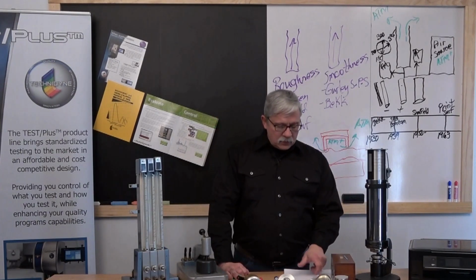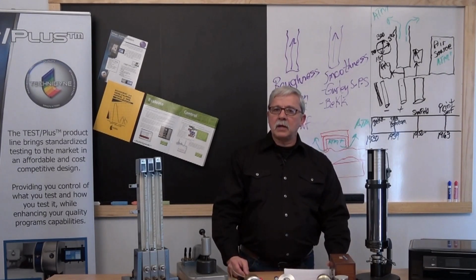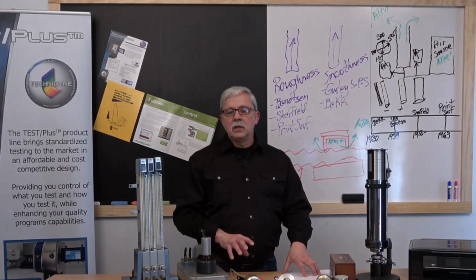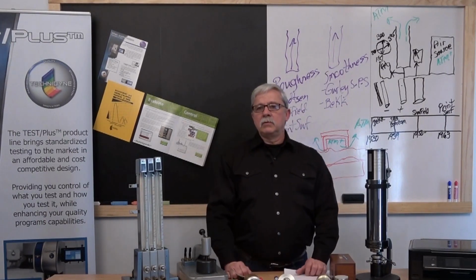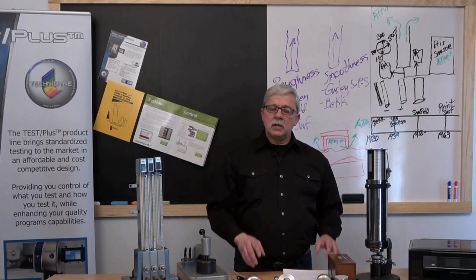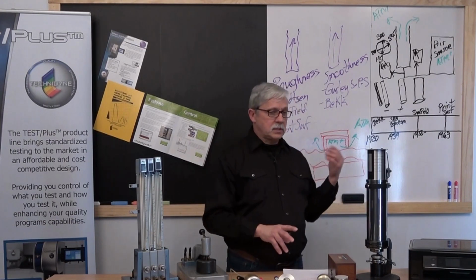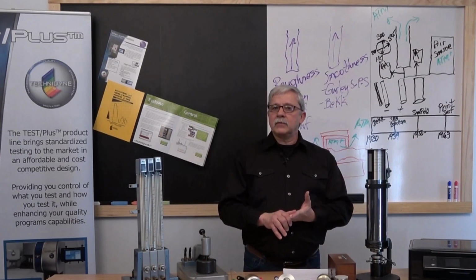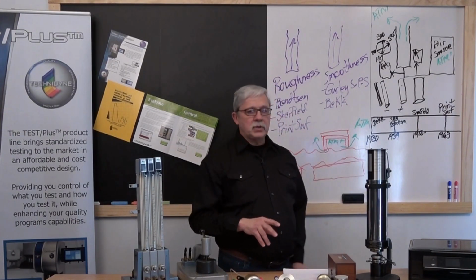So that gives you a quick and dirty rundown on the development of these tools, a timeline somewhere in the 30s up to the current day. These products are being used. When we get back to the next series of video tutorials, I'm going to go ahead and dive a little bit deeper into the specifics of each one of these tests that I just mentioned here: the Bekk test, the Bendtsen test, the SPS test, the Sheffield test, and the Print Surf test.